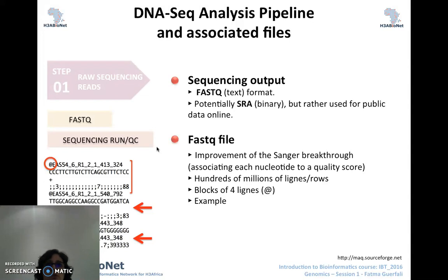Just what you need to know is that these could be translated by a number of downstream programs, and be careful because the scale of these quality scores could be different between different platforms. So, for example, if you have values higher than 90, then this would be an Illumina score, etc.